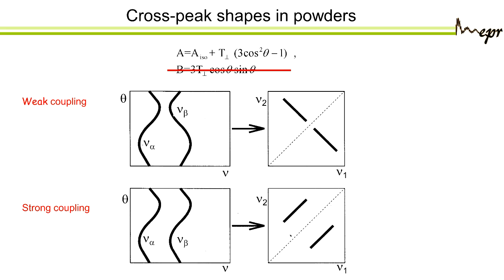So you can tell from this smallest difference that this belongs to this particular angle. So now if we go to the largest coupling, then we get this blue correlation. And of course, you have all of them in between. So for the weak coupling case, what we get is a line that will be perpendicular to the diagonal, and the width of this line gives us the anisotropy.